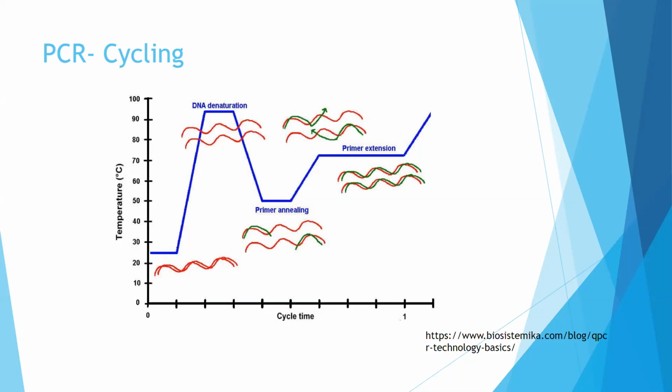It will continue. In cycle 2, the DNA double strand will denature once again to 2 single strands. Then annealing of the primer and TaqMan probe to its complementary part of the target DNA. TaqMan probe contains a fluorophore covalently attached to the 5' end of the oligonucleotide probe. Fluorescence is emitted by the fluorophore when it is excited by the cycler's light source. Also, the probe consists of a quencher at the 3' end. The close proximity of the reporter to the quencher prevents detection of its fluorescence.